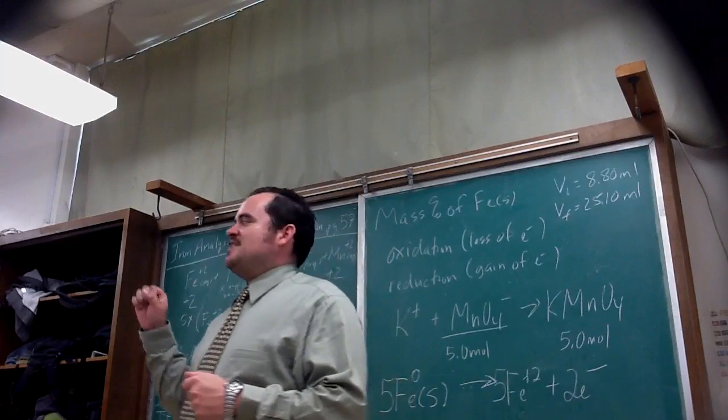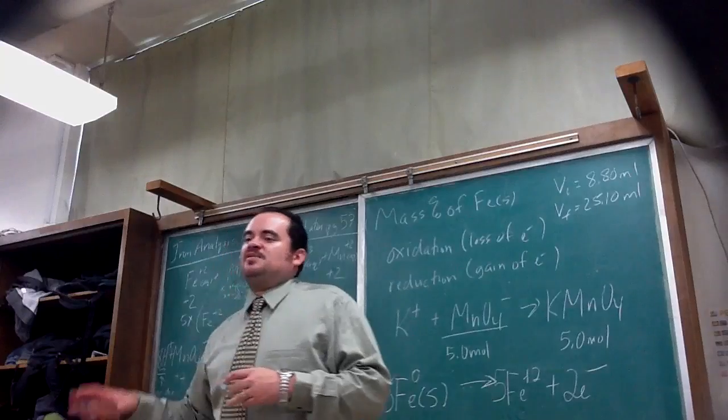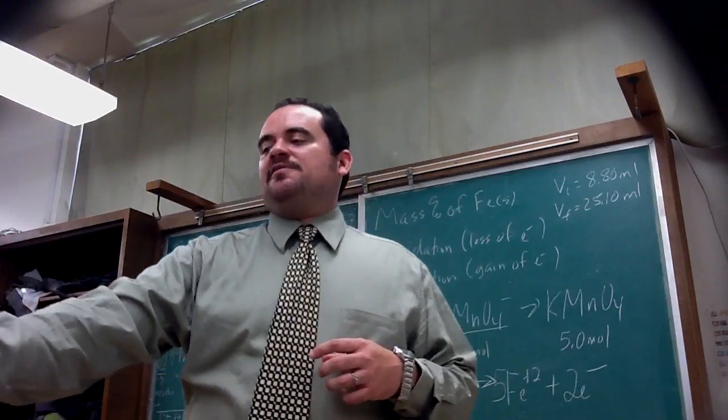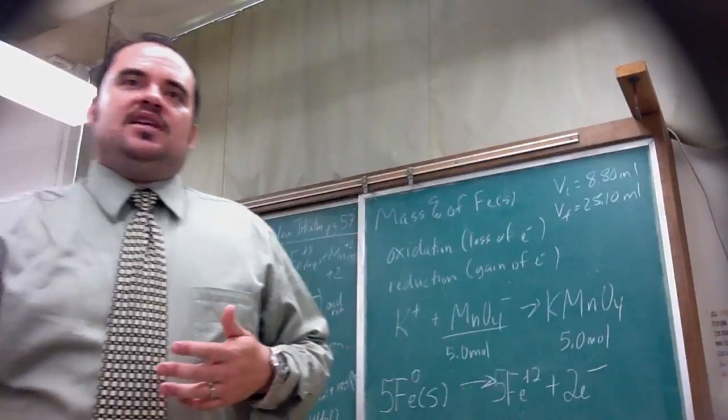It's also, like I said, an oxidizing agent as well. So that's why we don't want you reacting with this stuff, putting this stuff inside here until you're ready to titrate every single one. So before you do the runs.